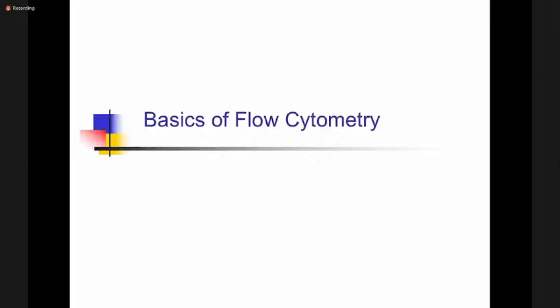Okay. Now, for the case of flow cytometry, just like the name suggests, there's something which is detected in the fluidic system. So then cells, which last time we were talking about, you extract the DNA, then amplify a segment of it. In this case here, we are going to look at the property of that cell, and the cell is subjected to some laser light, and then excitation of that cell is going to emit signal. So that signal is what is captured, hence the flow cytometry.